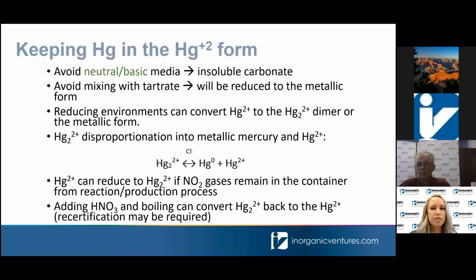But again, recertification may be required in this case because you are adding additional volume and then boiling down. So you want to make sure that if you do use this process, that you still know the concentration of mercury in your standards.